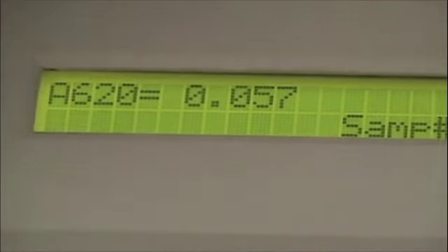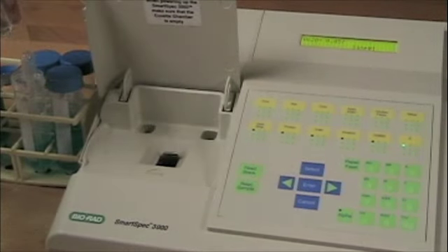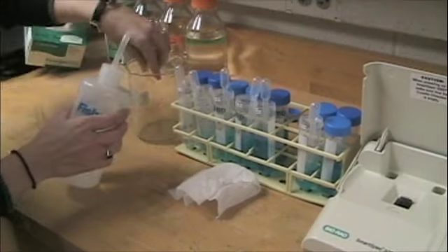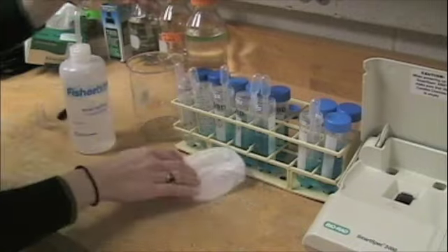After you have that recorded, you are going to take your cuvette out, and I'm going to dump it in my waste beaker. I'm going to rinse it out real quick with my DI water, and I'm ready for sample 2.